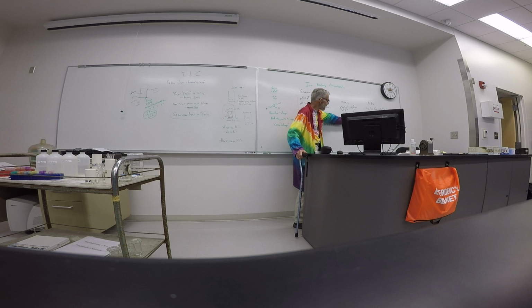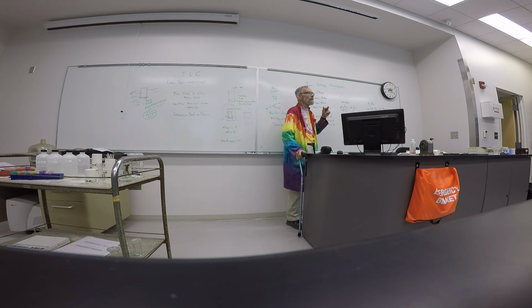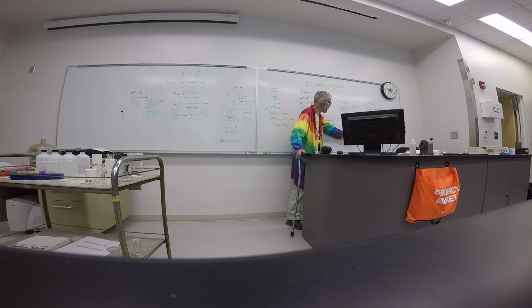And then, since that ninhydrin likes to react with these NHs, a second ninhydrin will say, hold it, there's an NH group there that I can react with. So a second ninhydrin comes and tries to react with that NH. It can't do the same exact reaction. What it will do is hook 2 of these together. And once it hooks these two together, you've got this wonderful aromatic system where we can go from there to there to there to there to there. Big aromatic system, big strong absorbance, and this has a deep purple color. Usually it's deep purple.